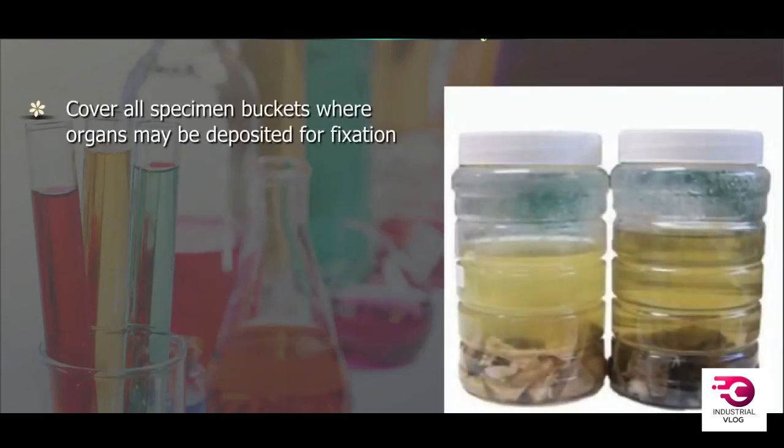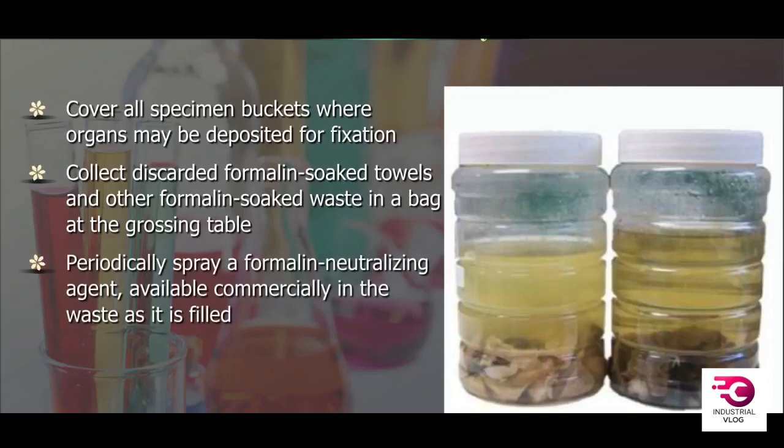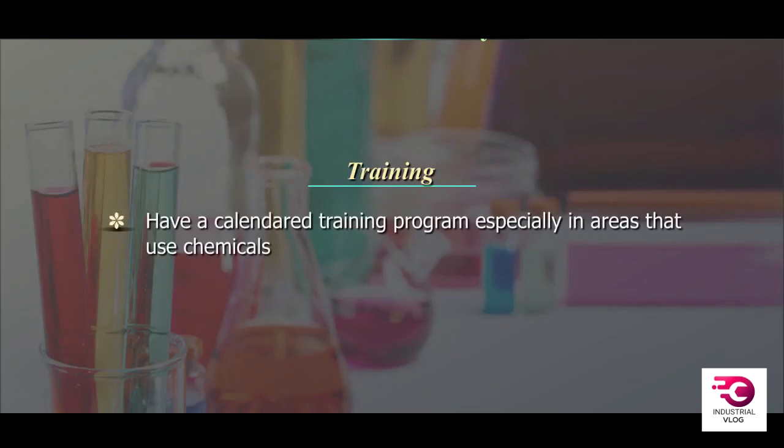Cover all specimen buckets where the organs may be deposited for fixation. Collect discarded formalin-soaked towels and other formalin-soaked waste in a bag at the grossing table. Periodically spray a formalin neutralizing agent, available commercially, in the waste as it is filled. Seal off the bag when it is filled. Formalin badges to indicate the exposure level may be available in the near future. Training. Have a calendared training program, especially in areas that use chemicals, and have evaluation of that training.